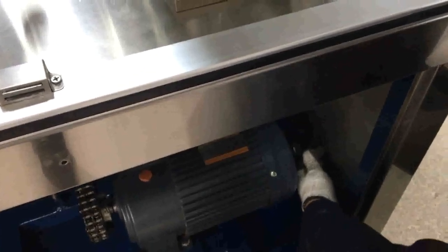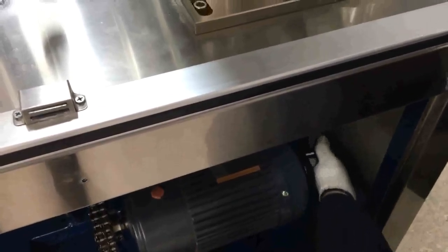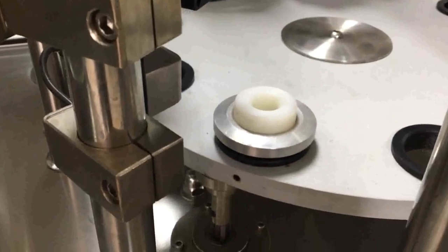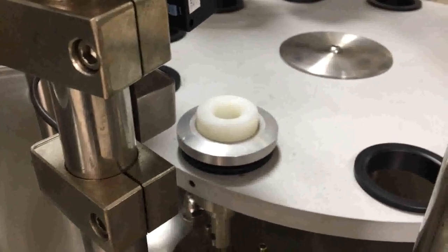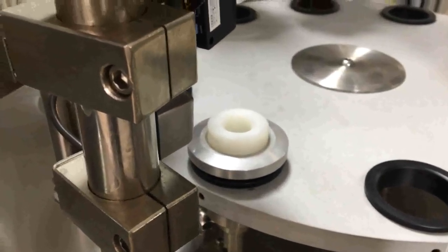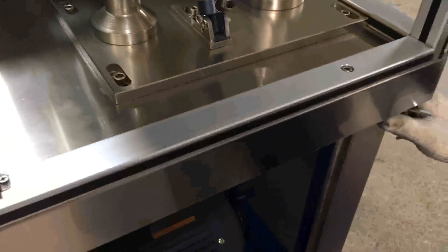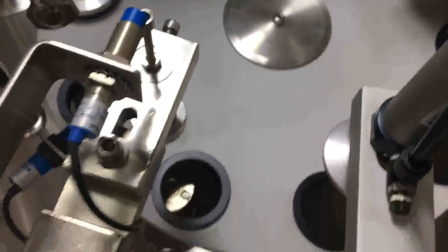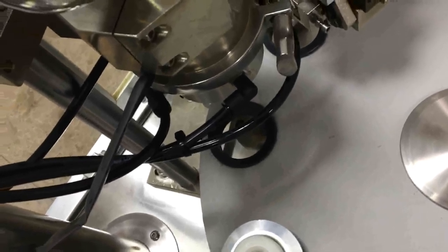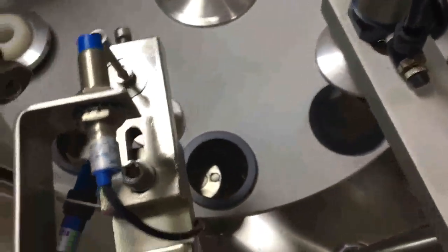Rotate the motor crank anti-clockwise by hand; the rotator disc will move clockwise. Once the rotator disc arrives at the next station, stop. Check the injection rod at the color mark station, the filling station, and the heating station.